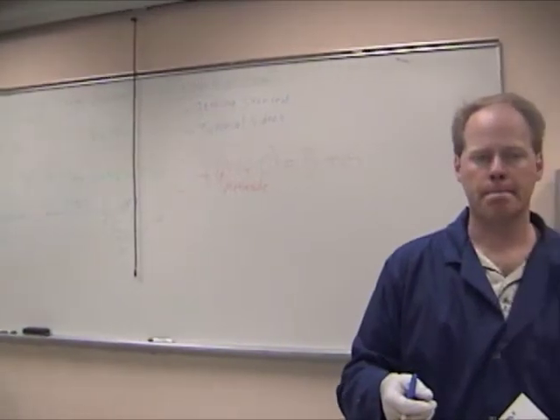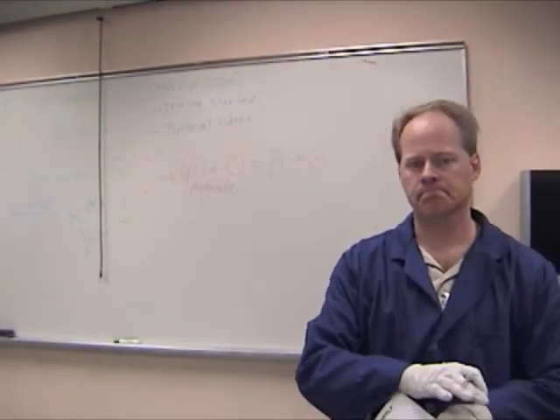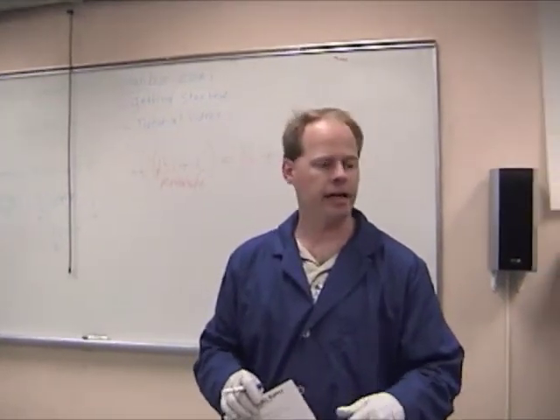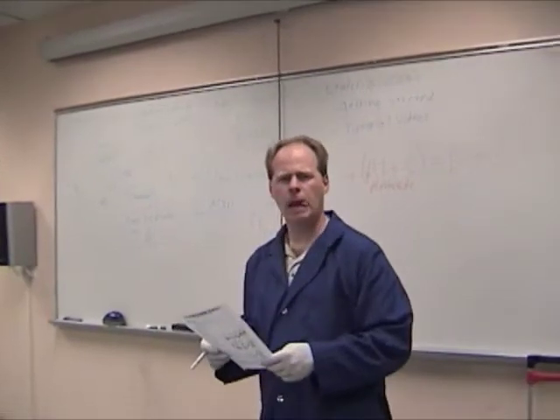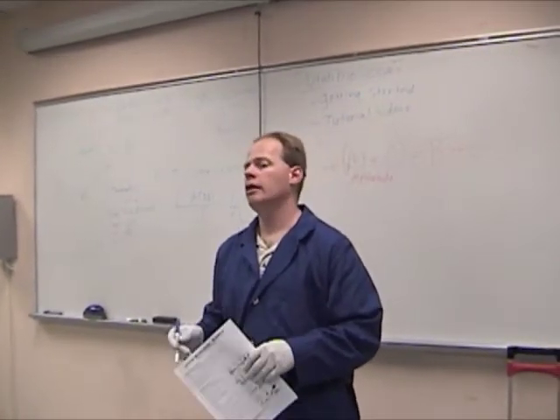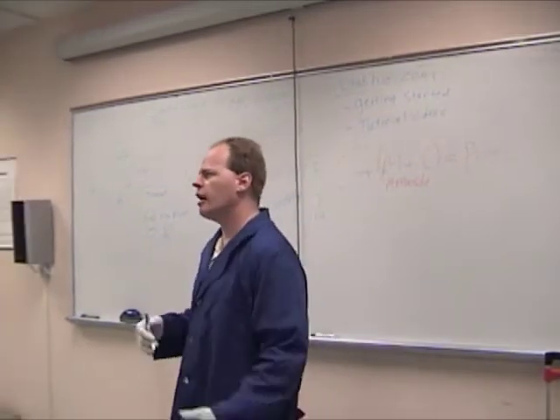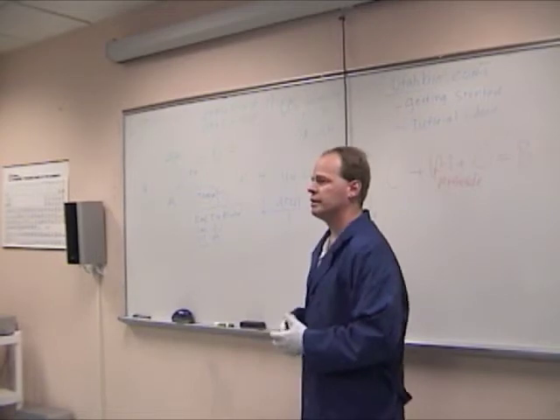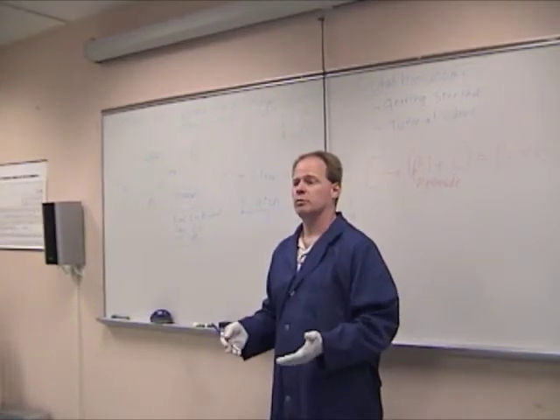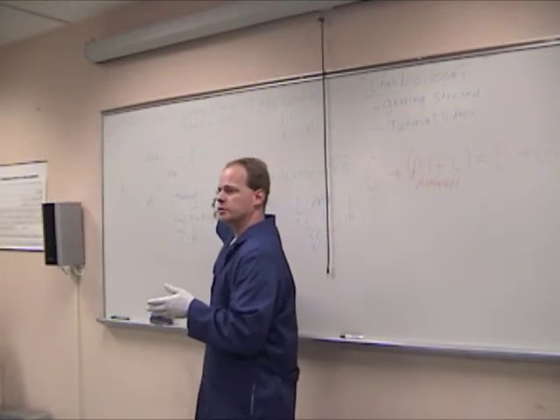A couple drops is all it takes to change it. If I was to add a couple drops of phenolphthalein into this, and we will before we're done, because we'll just pour that out anyway, yeah, it'll turn a pink color. Okay? So it doesn't change the chemical makeup. In fact, it's kind of important to point out. I get people that call all the time and say, well, how much phenolphthalein should I add? How much titration? Or how much of the phenol red? The answer is, it doesn't matter. Because it's not going to change how acidic or how basic the solution is.